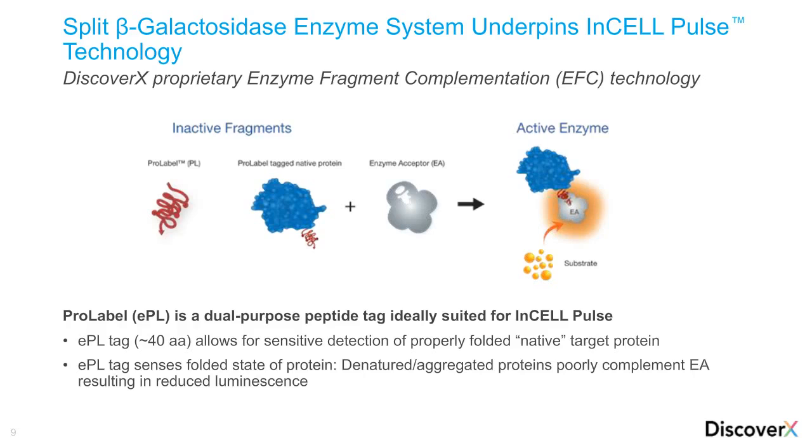So introducing you to the tools, I first wanted to show what is the technology that is behind InCELL Pulse. And you may have heard of this. It's from DiscoverX from the early 2000s. It's called the Enzyme Fragment Complementation technology. And basically, it's using a beta-galactosidase enzyme.